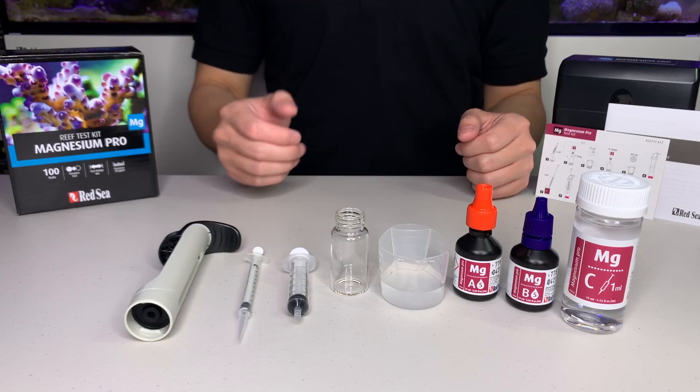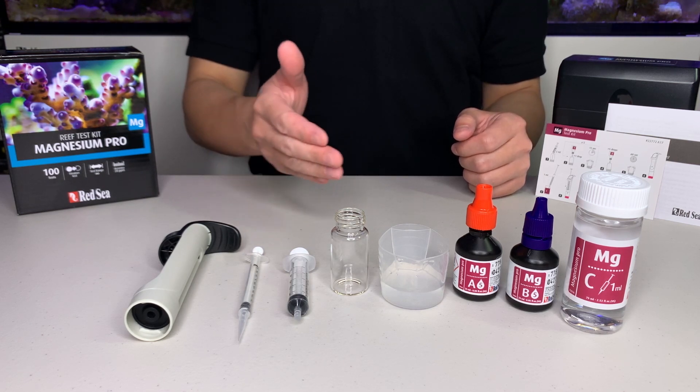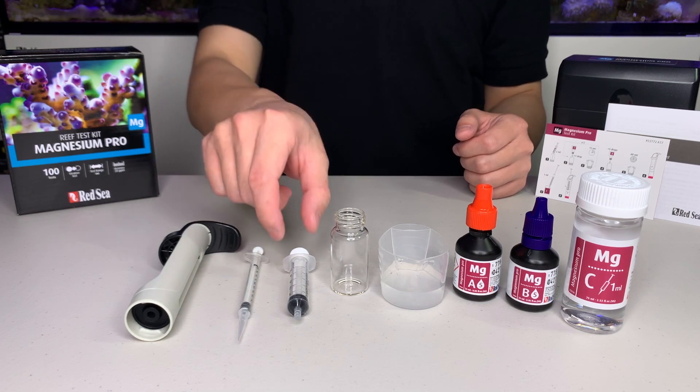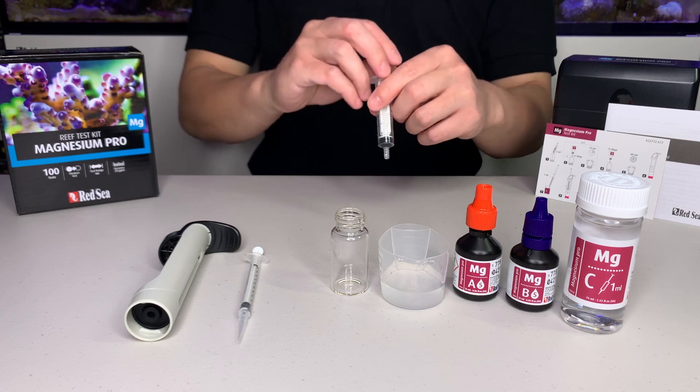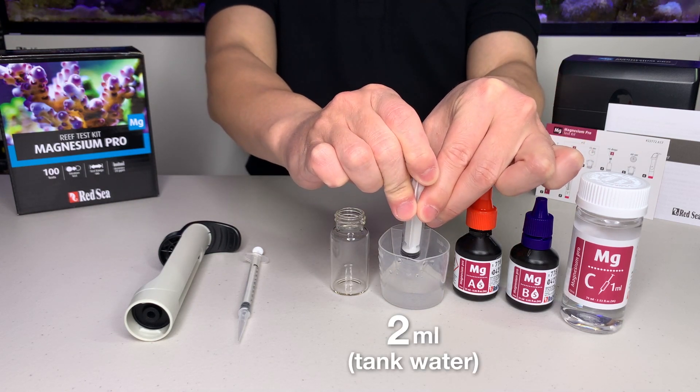Before we start the test, I have prepared a sample of water from my aquarium and I've washed and dried all my syringes and vials, so we are ready to go. First, use the large syringe provided and place exactly 2ml of water sample into the glass vial.